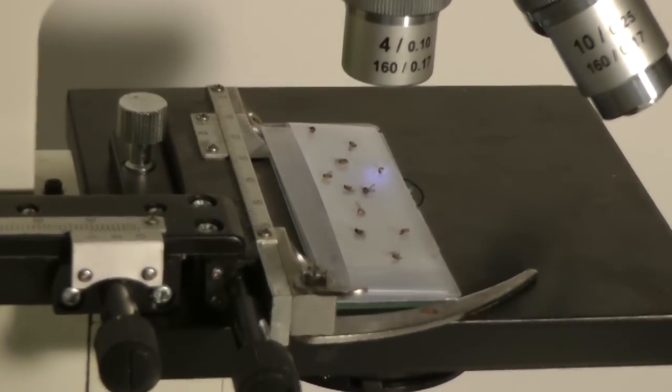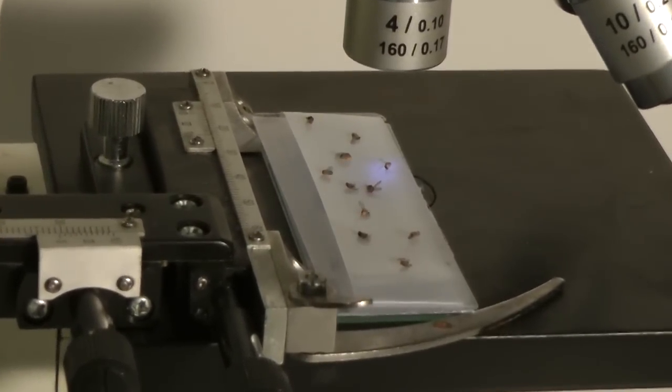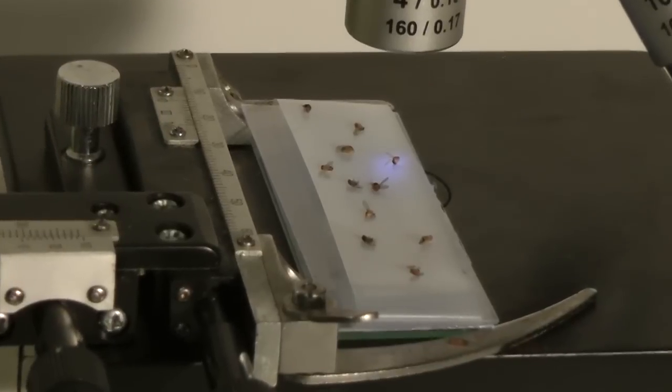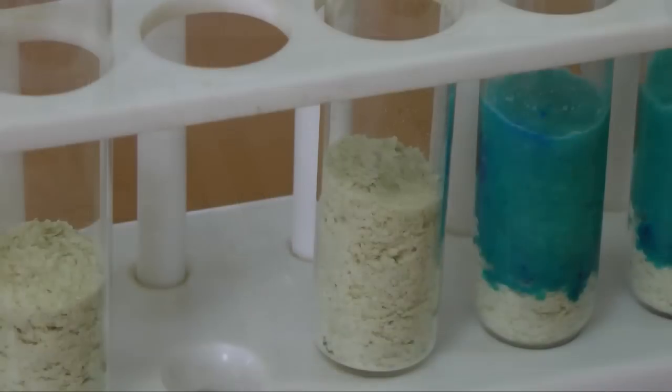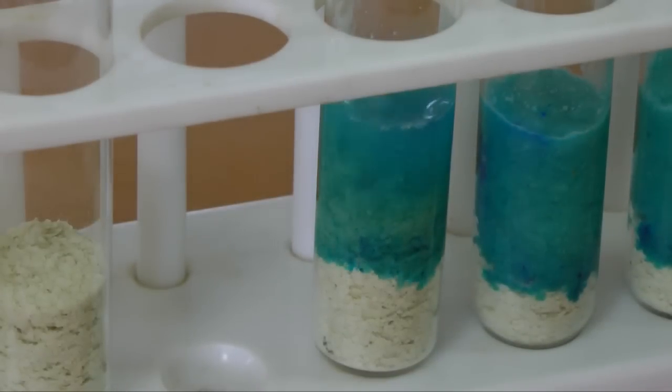If you have watched our video Genes and Flies, you will know that an extraordinary discovery about the mechanisms of inheritance was accomplished by studying the common fruit fly, Drosophila. You may be interested to know that you can actually replicate this Nobel Prize winning experiment at home. I'll outline the basic procedure in this video.